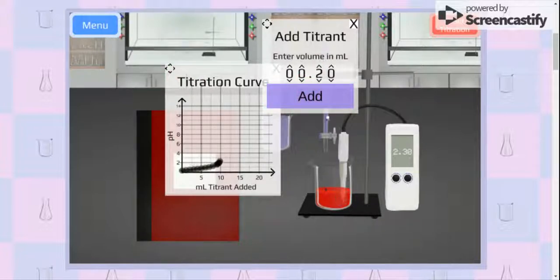And if you look at the color, it's still red for an acid, but now it's suddenly turned blue at a pH of 7. It's the same equivalence point, even though we've changed our concentration. So we'll now just add a bit more and speed up and so on.